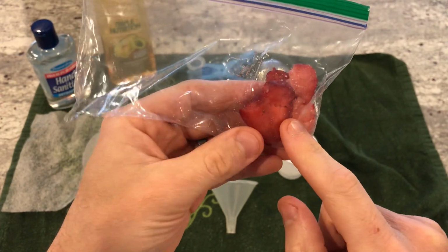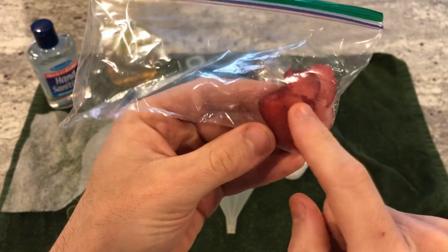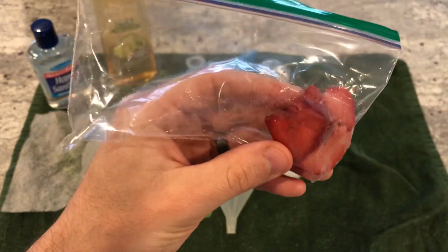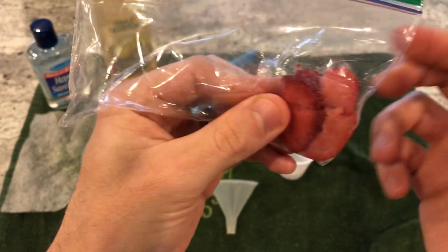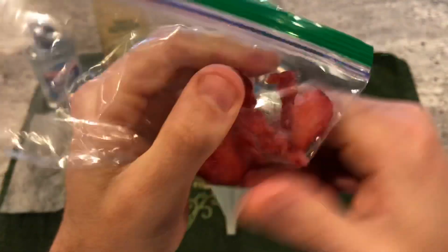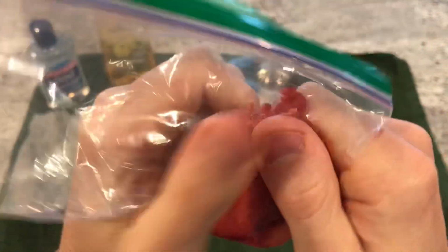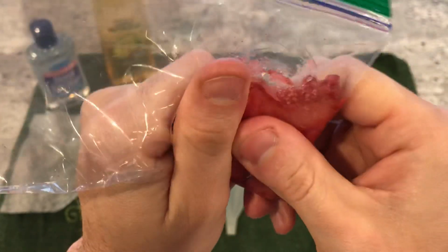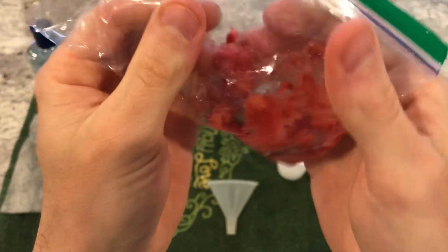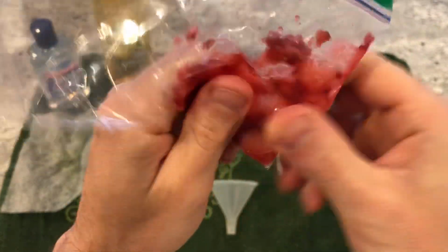All right, we're in the unit on DNA, and food has DNA in it, right? This is made of cells. This strawberry, so is a banana, so are peas, so are chicken. But I don't recommend handling raw chicken. But any living thing that you're eating contains cells, which means they contain DNA. So you're going to take a little bit of your food source, right? A piece of a banana, a bunch of peas mashed up, or whatever. You got mushrooms at home nobody's going to eat, whatever. Try all sorts of different stuff. I'm not grading you on whether or not you get perfect results. I'm grading you on attempting it accurately.